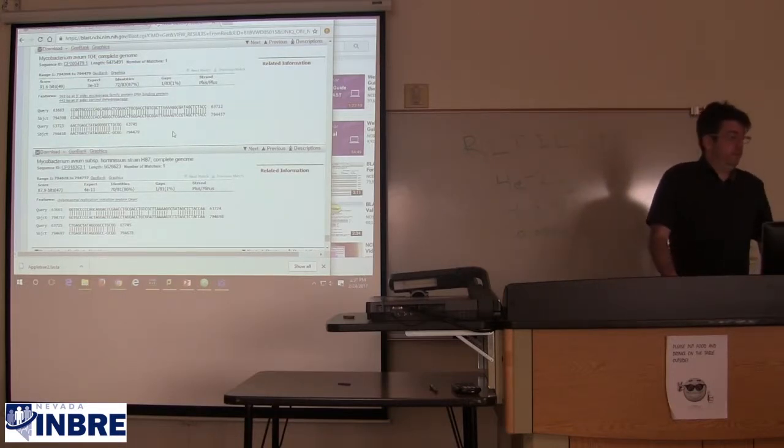So it isn't showing human sequence, but you've got this bazillion bases in a human sequence. Wouldn't some match by chance up to these? Yes, but we only get to see the top 100 hits. So whatever regions of the human genome may have short matches would be down much lower.